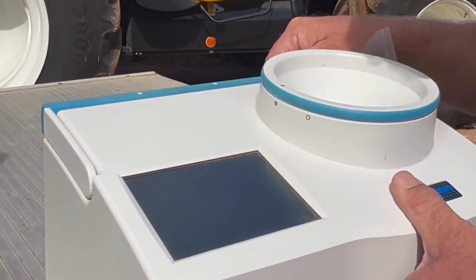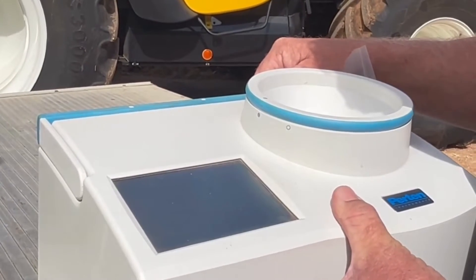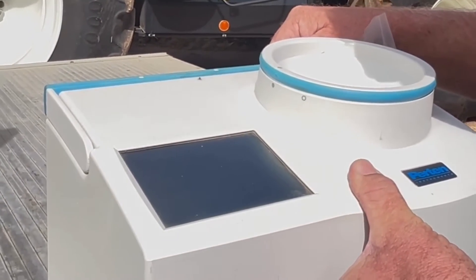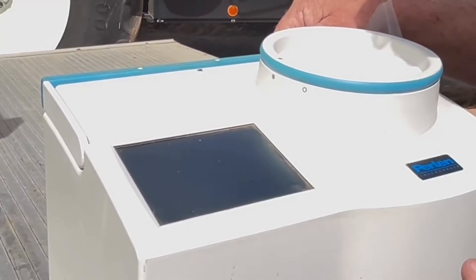It shows it on the screen — yes, it comes up with your protein and moisture. So here your moisture is 11.6 and the protein is 10 percent.